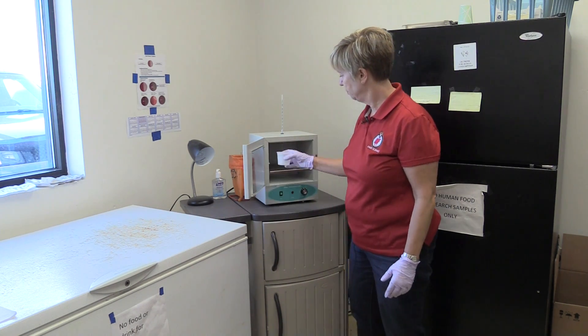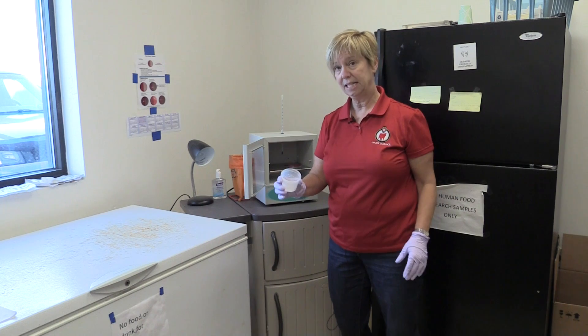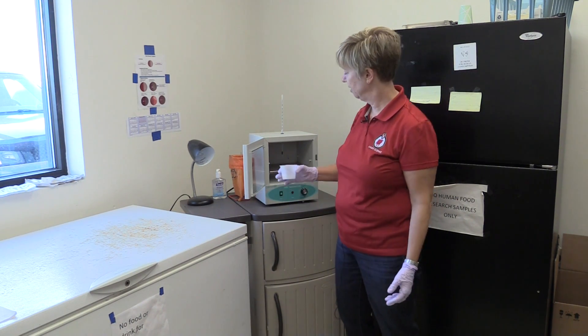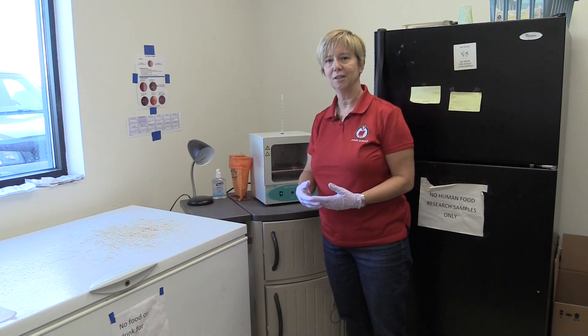Within that incubator we need to have space not only for the media used in our on-farm culture program, but we also like to have a small cup of water — just regular tap water — inside the incubator in order to maintain the appropriate humidity to allow us to effectively grow the bacteria.